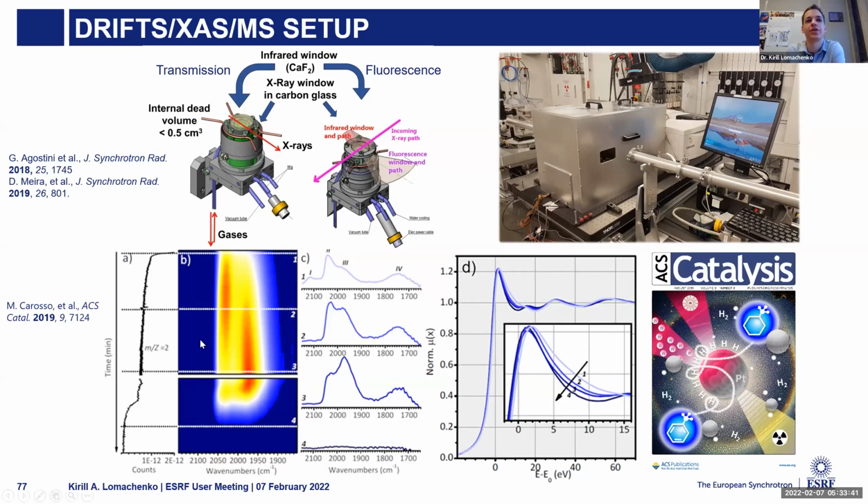And all this was as a function of hydrogen partial pressure that we monitored, also the amount of hydrogen in the feed we monitored by a mass spectrometer, all measured at the same time with the same sample, which is particularly important for this kind of experiments.